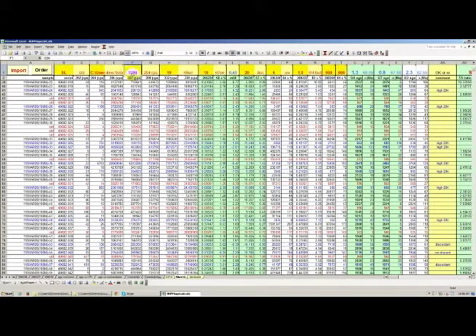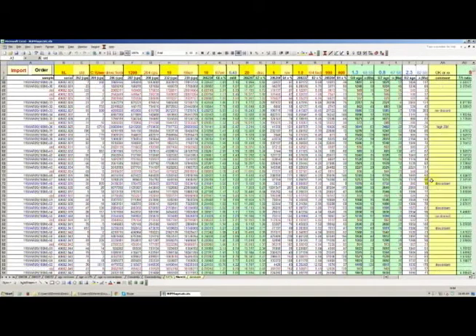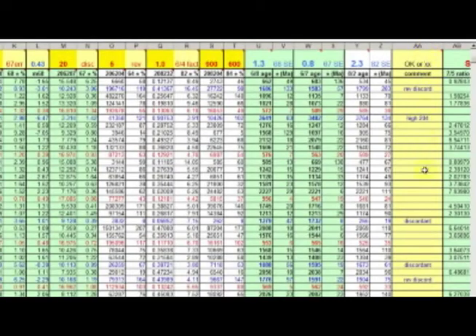and you'll be able to see that as I change this and then hit order, a lot of these grains that were highlighted in blue are either not going to be highlighted anymore or are going to be just filtered out by some of the other thresholds that we've set if they violate some of the maximum uncertainty filters. So I'm going to go ahead and click order and scroll down again to that part that had a lot of high 204 grains, and you can see from column AA that a lot of those high 204s are gone.